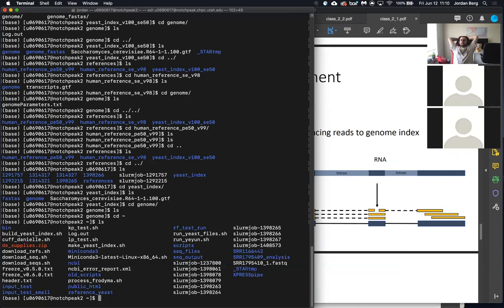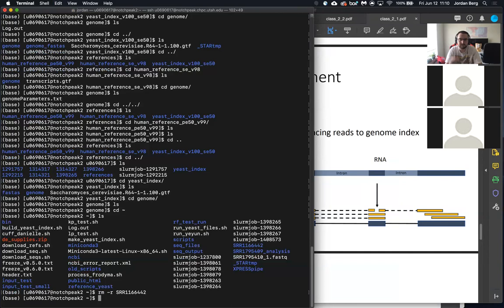I got all of those files, but I also got some errors. I went to the final output directory and checked for FASTQ files, and I had all those files there. I made a Word document for that. Maybe I can send you that, and that'll make it more clear.